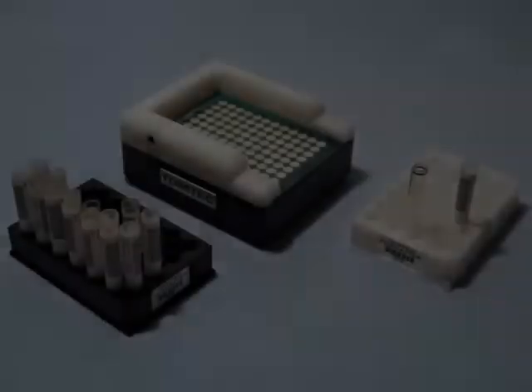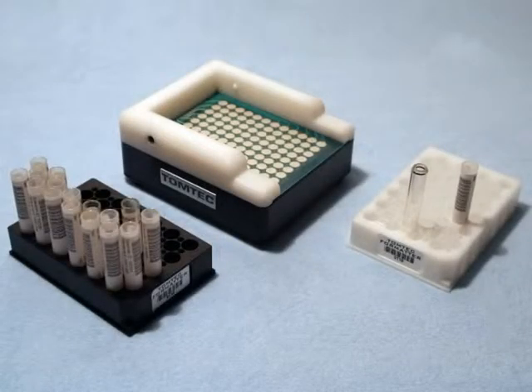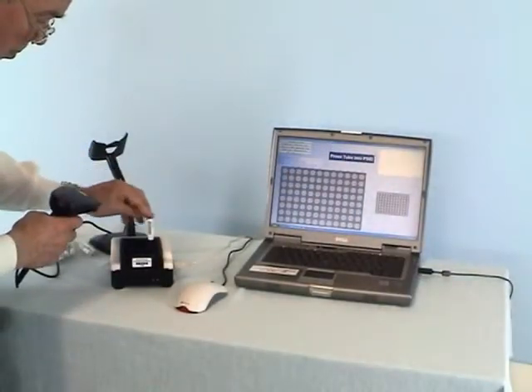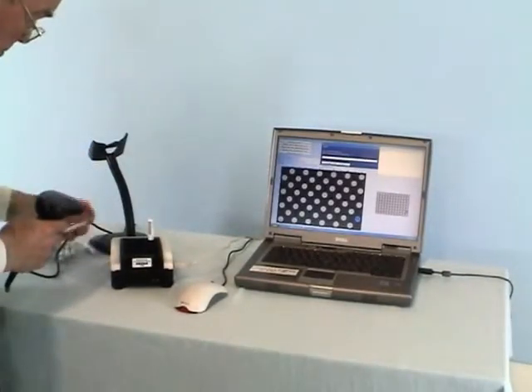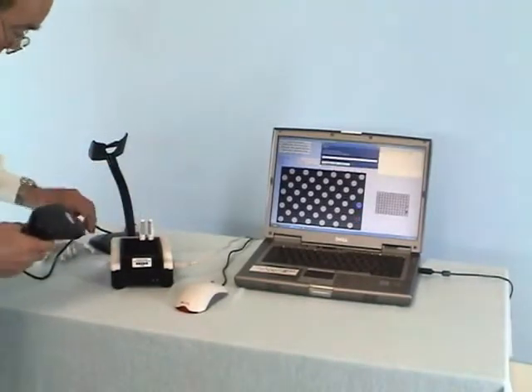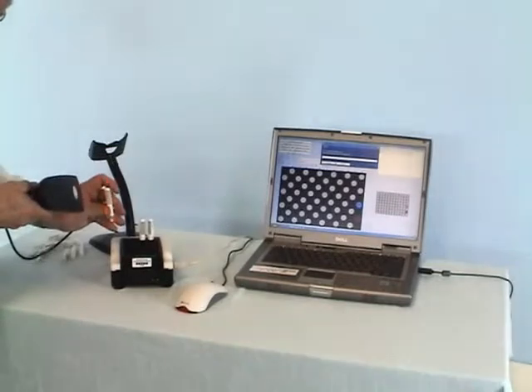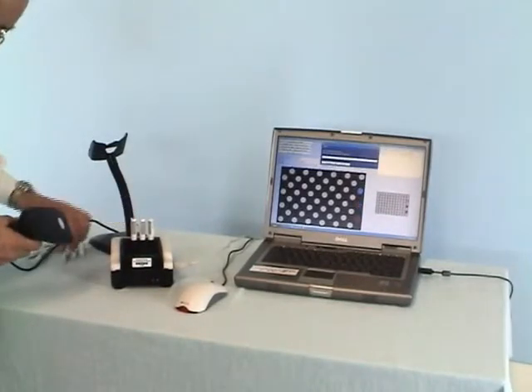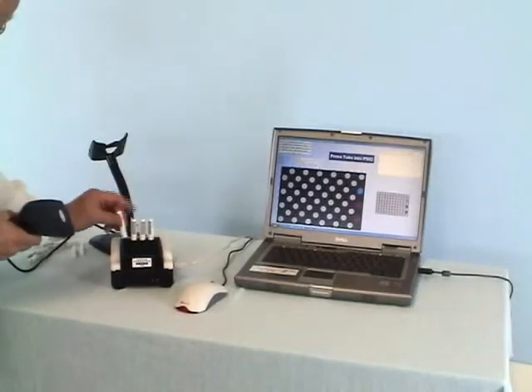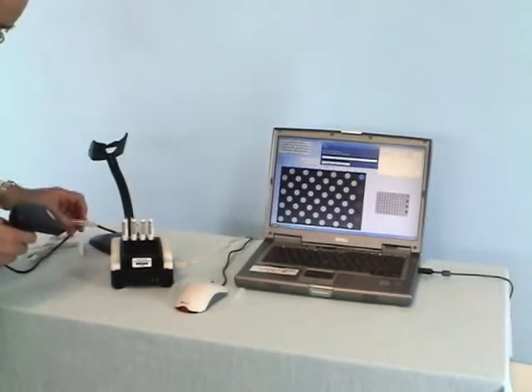To provide sample custody, TomTec has developed the PSID-2. This tracks the barcoded 12 by 75 tube into the 96-well format. The PSID-2 has a touchpad. The barcode of the mirror rack is wanded into the file. Each 12 by 75 tube is wanded into the file and inserted in the mirror rack on the PSID-2. The touchpad logs the vial barcode into the 96-well rack position.